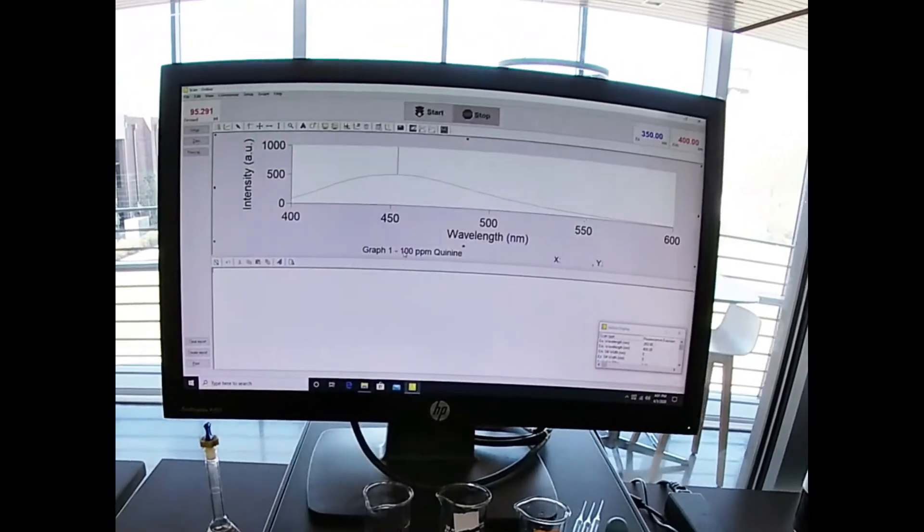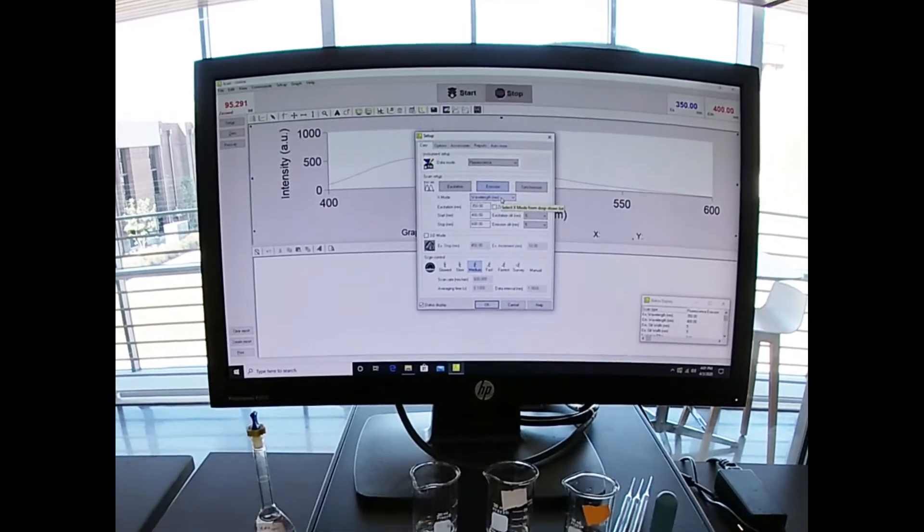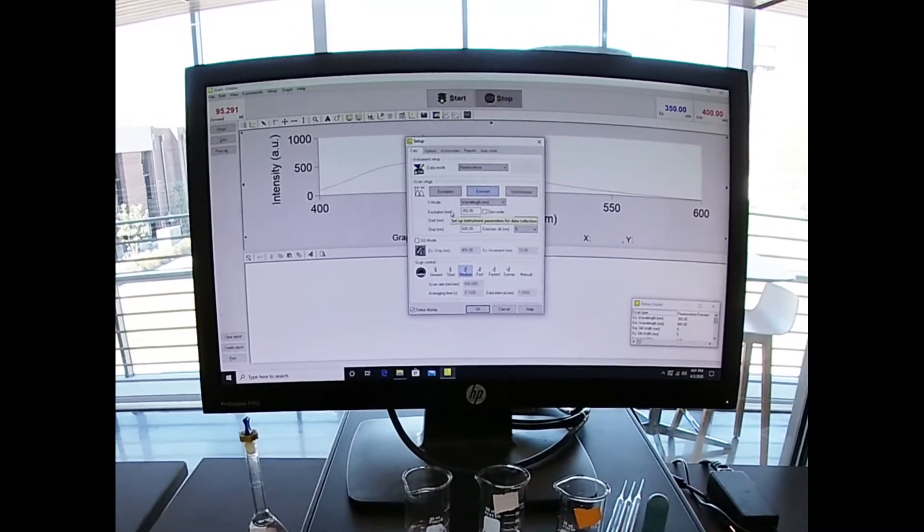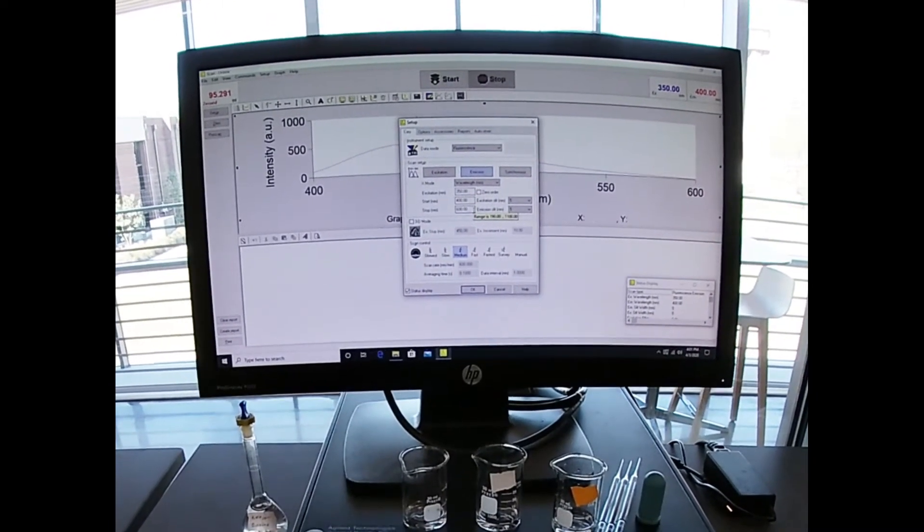This is our software. I have this set up to do an emission scan. We know the excitation is 350 nanometers is where we absorb the energy, and so we're going to scan from 400 to 600 nanometers.